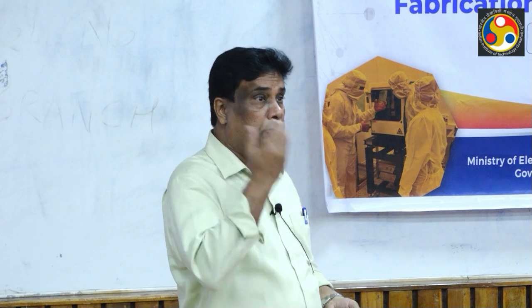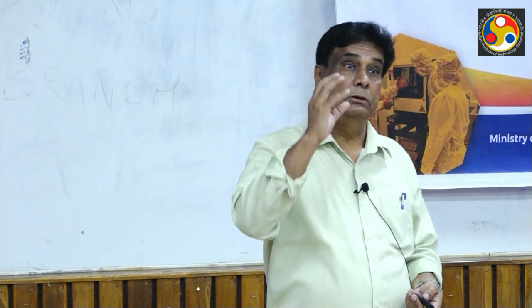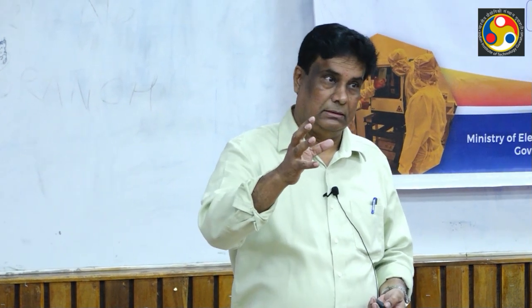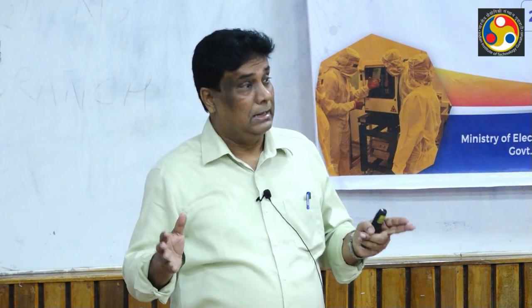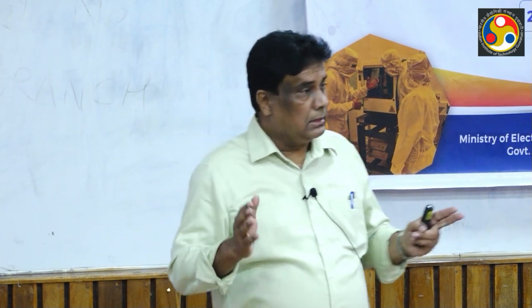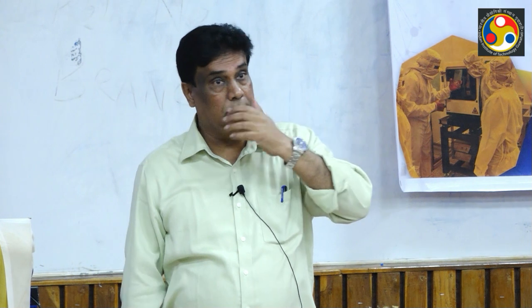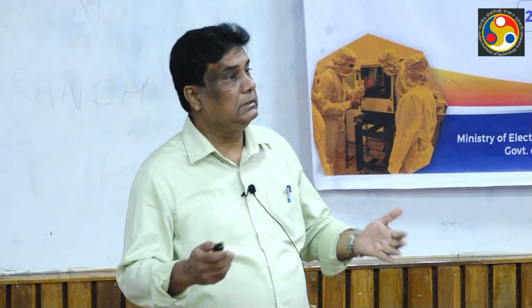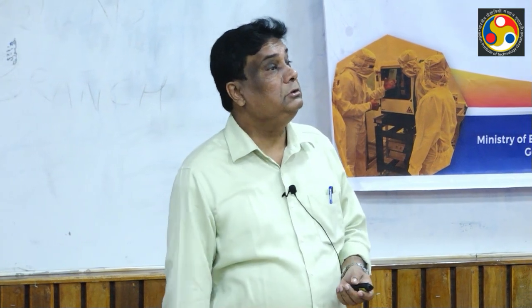When we talk about our eye versus the microscope, in both cases we are working with a lens. Our eye is a magnifying lens, but it has a limit. If you are not able to see within the limit, then you need the light microscope at the micron level. When we talk about the limit, there is a very important term called resolution.